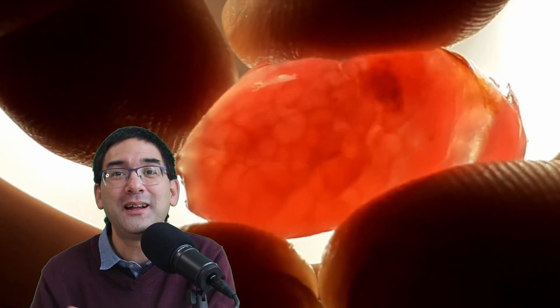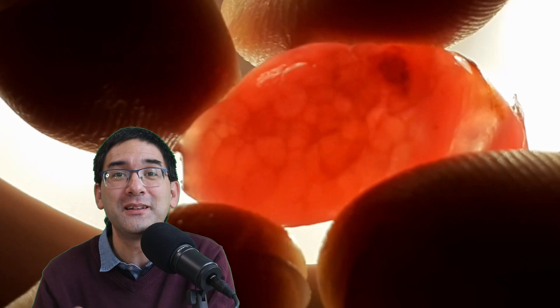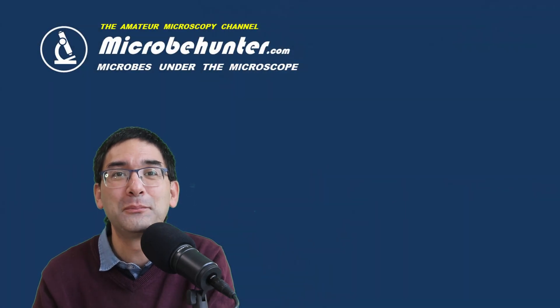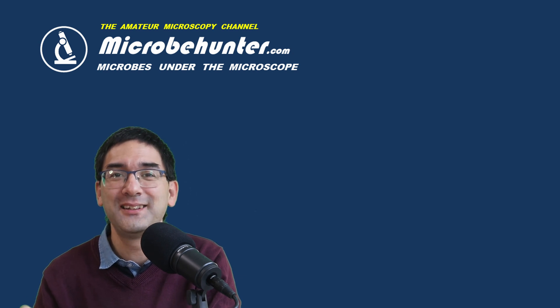Well, I think I'm gonna leave it at that. Now you can see with a little bit of processing and specimen treatment you can pretty much put anything under the microscope. Happy microbe hunting as always and see you around next time. Bye.